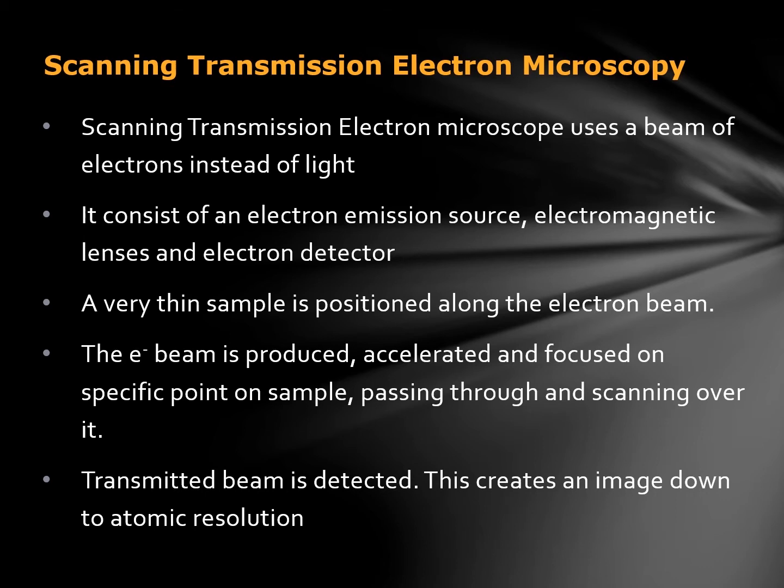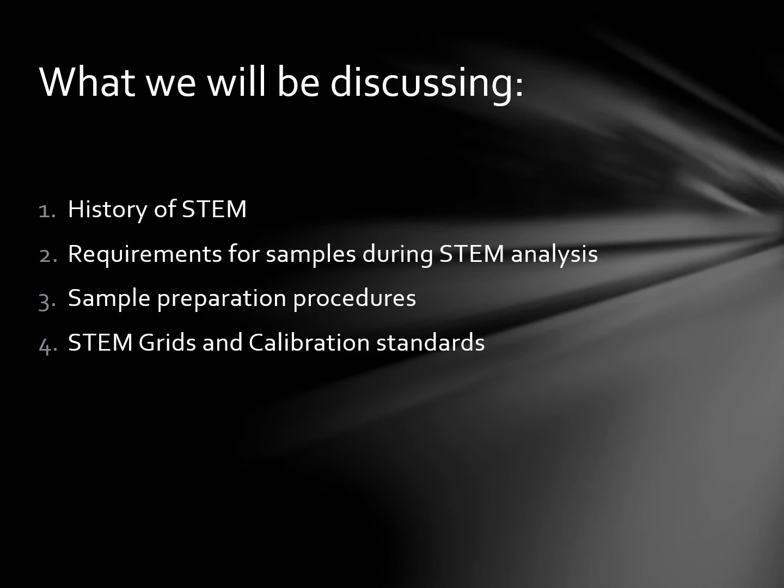So what we will be discussing today is just a brief history of STEM, and then some requirements that are crucial for samples during STEM analysis, and then also just the sample preparation procedures, and we will be discussing in brief the STEM grids and some calibration standards.